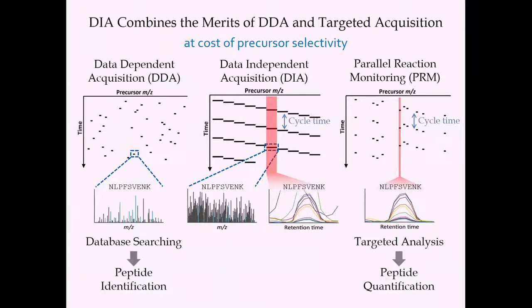On the other extreme, we have parallel reaction monitoring or selected reaction monitoring. In this case, we tell the mass spectrometer to measure very specific precursors because we're interested in specific peptides. And as was already brought up earlier this morning, you sample these things in a systematic way. So we're repeating the acquisition of MS spectra in a cycle time that allows us to reconstruct the chromatographic peaks. We then extract the product ions from these data. This is just an example showing parallel reaction monitoring.